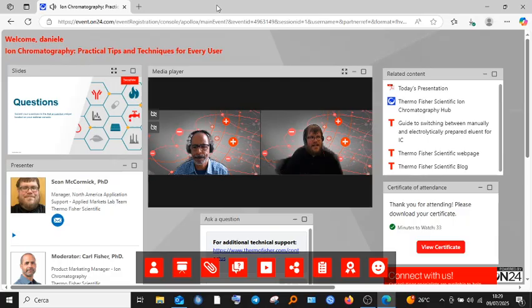The great thing about IC is that it really can handle a lot of different backends and can supplement other types of information being collected in your lab. So you can connect an IC system to a mass spectrometer, a good old triple quad, single quad, Orbitrap for doing complex work where you can get lower limit of quantitation, more selectivity, and actually get more chemical information about your samples and about the analytes that are eluting off your column.